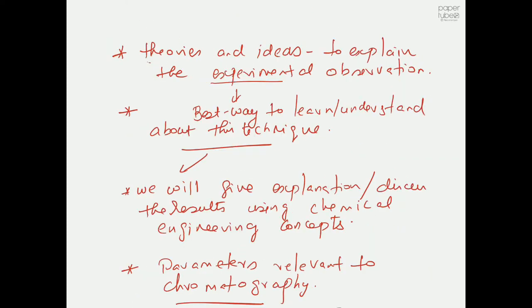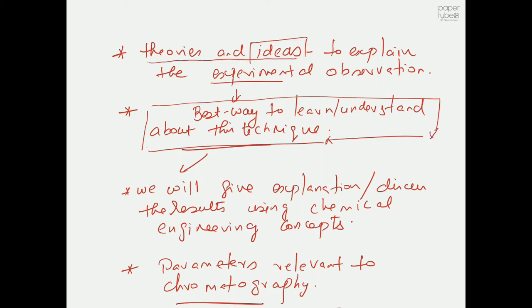Then we will learn something about theories, or you can just call them scientific ideas, that will help us explain the experimental observation. And I just put a note here. For chromatographic techniques, you can read a handbook of chromatography, for example, but you will not understand anything, because it is such a complex process.